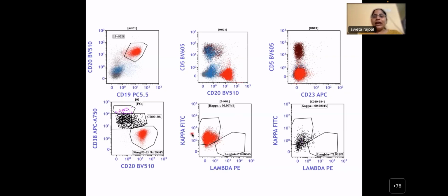Okay, and they are also showing surface immunoglobulin restriction. This is not cytoplasmic, but this is surface immunoglobulin kappa positivity. In multiple myeloma, we see cytoplasmic immunoglobulin, while in lymphoplasmacytic lymphoma, we see surface immunoglobulin positivity, like kappa positivity or lambda restriction. We can see any of these.